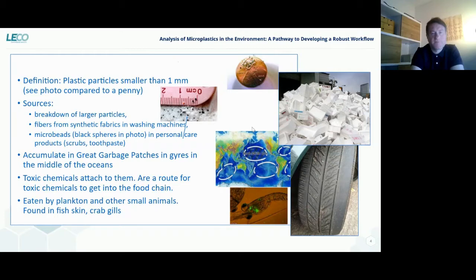One of the big things we're considering is thinking about the microplastics and also the associated toxic chemicals that can be attached to them, picked up by them, and then transported into the food chain, for example, but transported in general, and what effects that could cause. So we're keeping these things in mind when we think about the approach to analysis. Can we measure the microplastics, but also those materials that are associated, looking ahead to being able to correlate the chemical classifications as well as the microplastics, and so on.